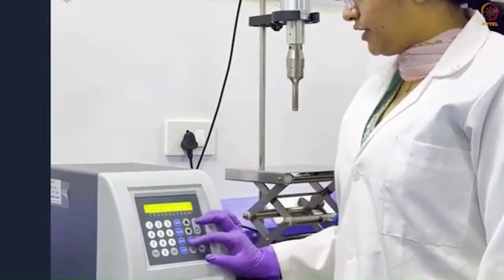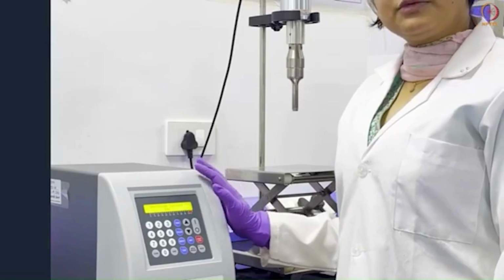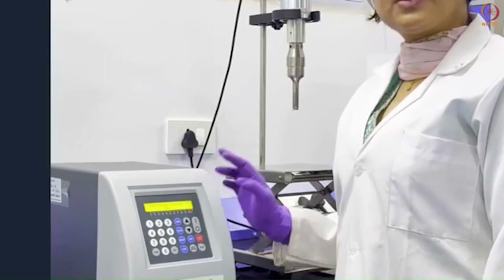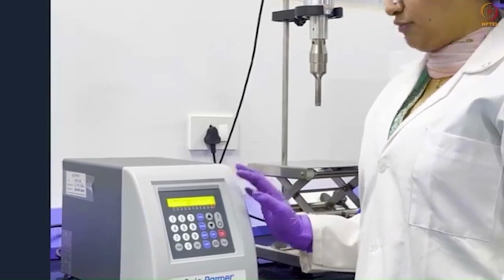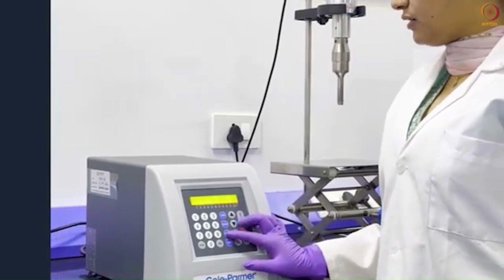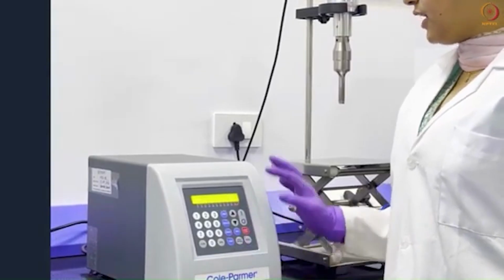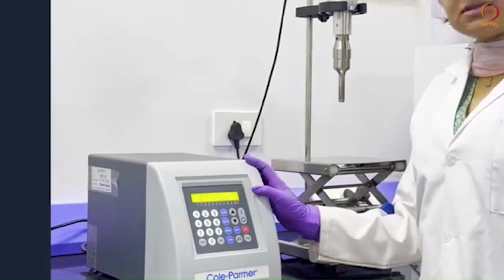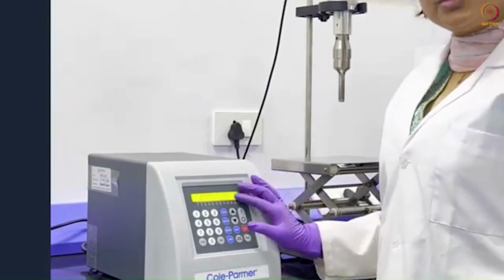Then here is the amplitude. We can set this amplitude from 0 to 100%. This amplitude is the strength at which the ultrasonication happens. Now here the last one is energy. It is the amount of energy transferred into the system, which can be shown here in joules.